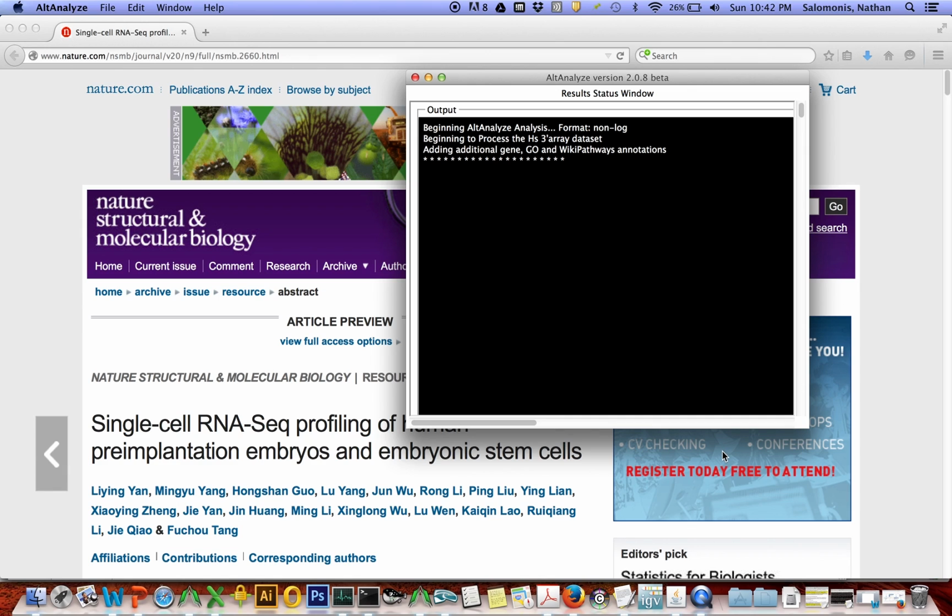This will take somewhere on the order of 10 minutes to an hour, depending on what default options we've selected. This analysis is probably going to take somewhere on the order of half an hour. And so I'm going to skip ahead now.